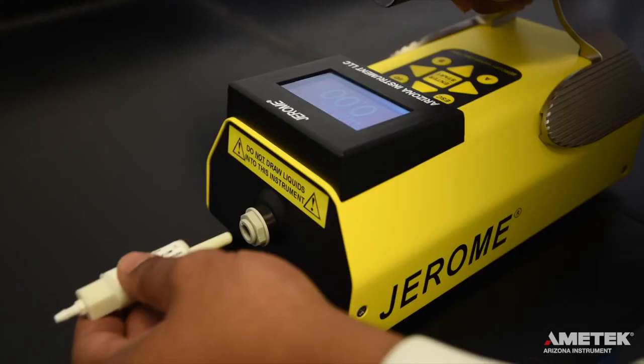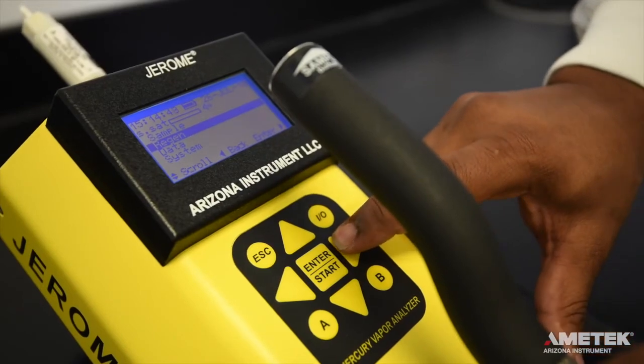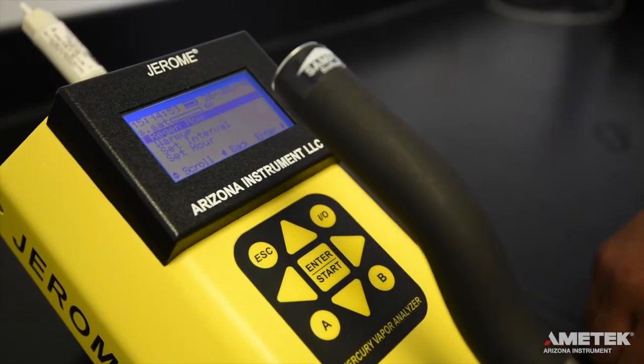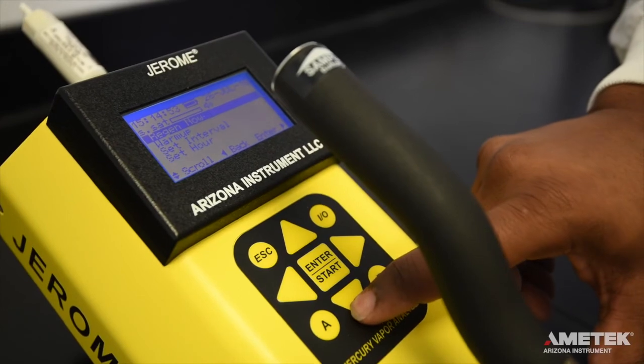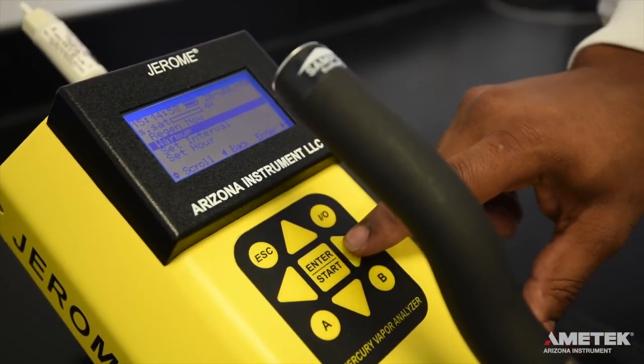Now that you have successfully performed a sensor regeneration and the clean air system check, it is time to take a sample. Please note that for EPA cleanup levels less than 3 micrograms per meter cubed, it is necessary to run a warm-up routine with the zero air filter before sampling. To do so, install the zero air filter and select warm-up from the regen menu. This will initiate a five-minute warm-up. For levels 3 micrograms per meter cubed and above, the warm-up is not necessary.